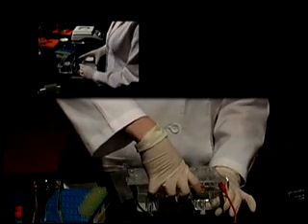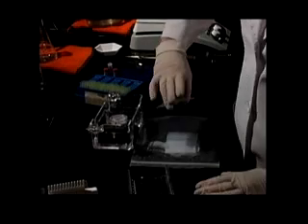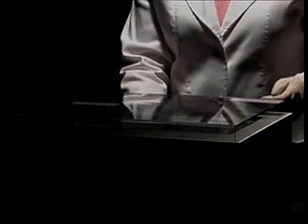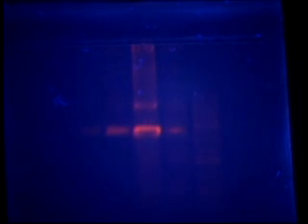To make the isolation more apparent, stain the gel for transillumination. When it's ready, take it to a transilluminator to view the bands. When struck with the ultraviolet light of the transilluminator, the dye in the samples will luminesce. You should be able to see a band of the D1S80 polymorphic region having traveled partway through the gel. How far it travels depends on how large the region is for each individual.